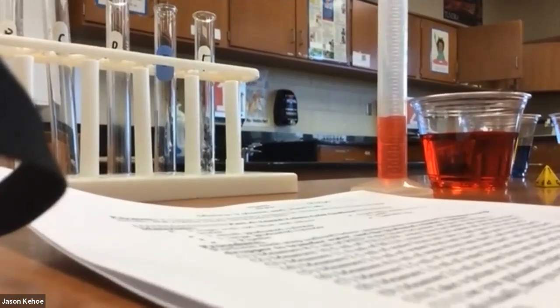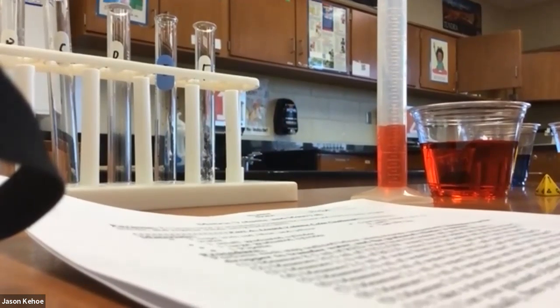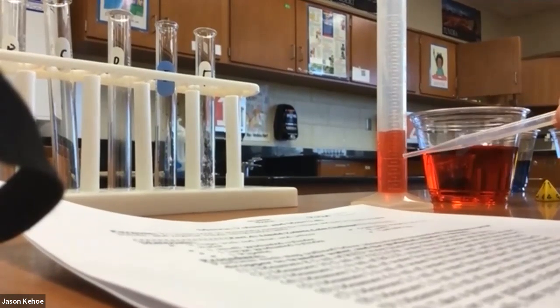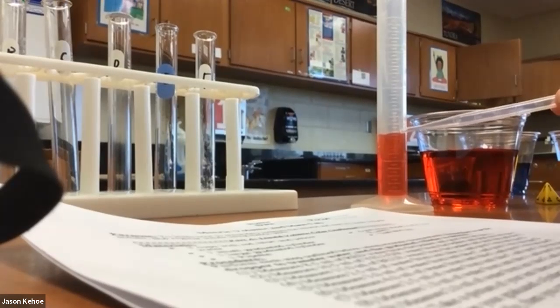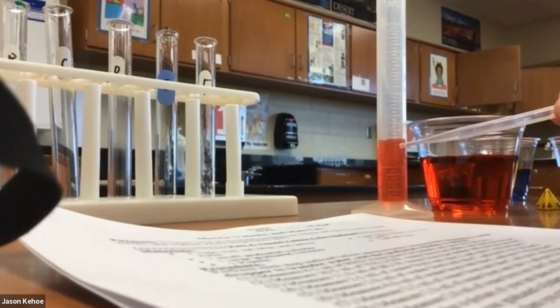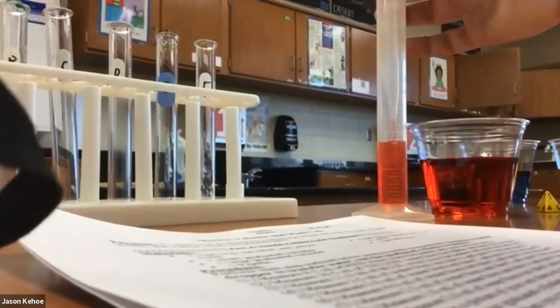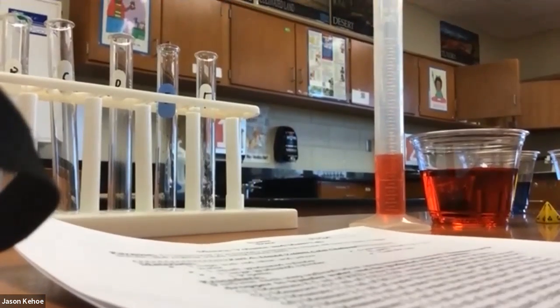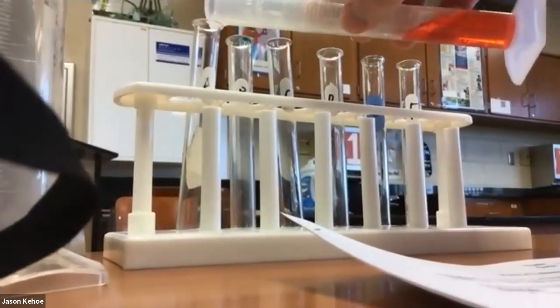Looking eye level with the water level and reading from the bottom of the meniscus, let's see, this is 5, 6, 7, 8. Wait, just a second. 5, 6, 7, 8. Oh, actually, I have a little too much. That was 9. On this one, every line appears to be worth half a milliliter, so you can use a pipette to remove a little bit. It says 8.5 milliliters, and it says to put that in test tube A.